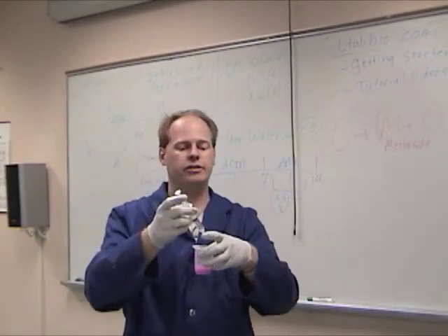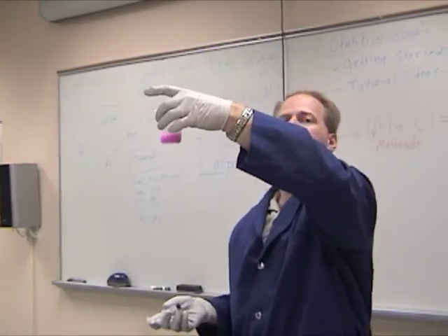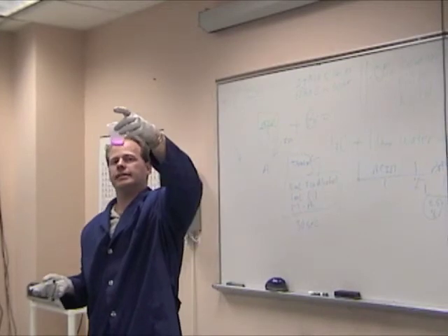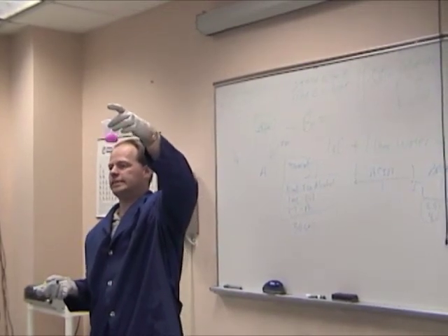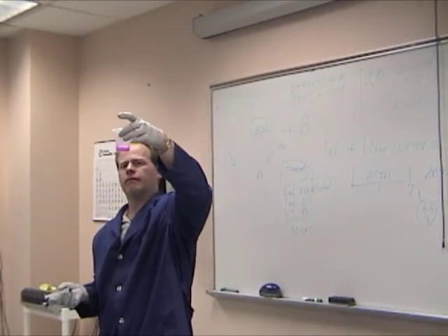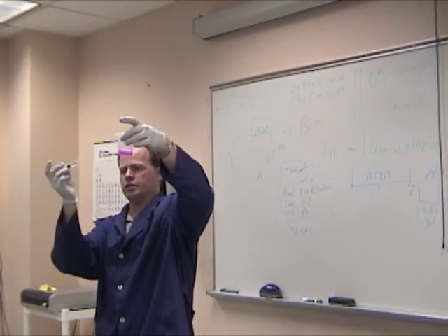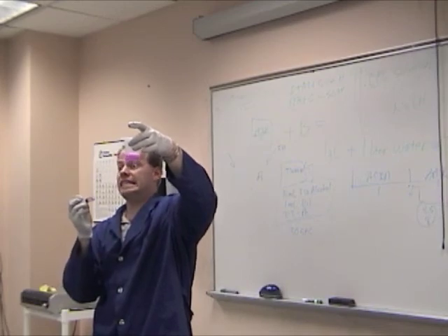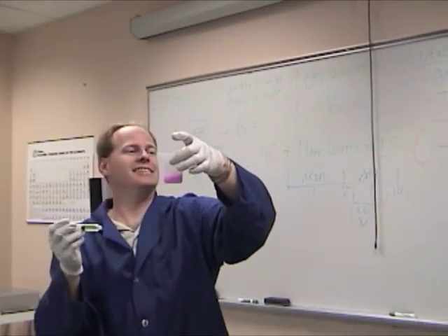If you want to watch a clock here, we basically are watching until it turns and stays. This stuff should stay purple, and this is the purple we're looking for, about 30 seconds. What is that now? This is titration solution. I started at 10, so I'm at 17. 17. That's bad, isn't it?